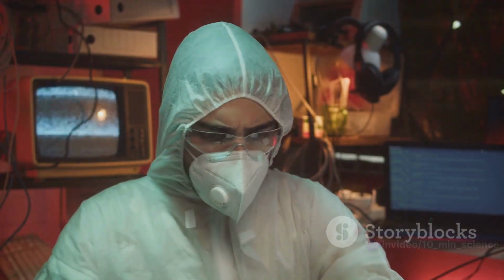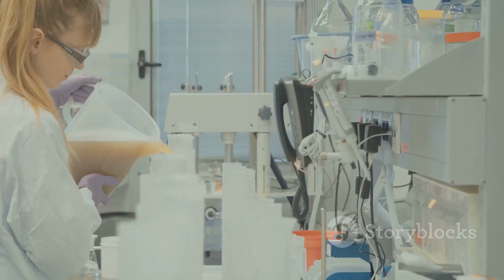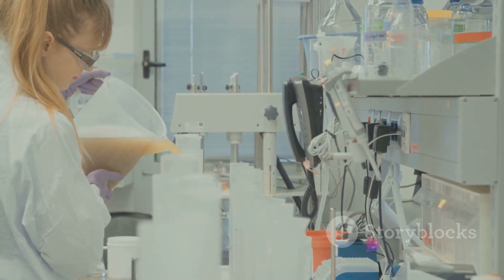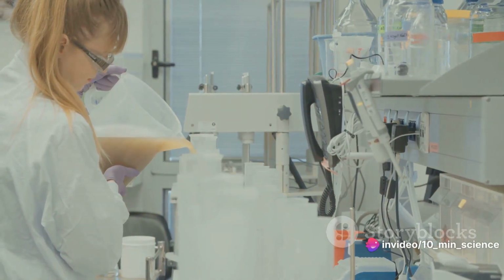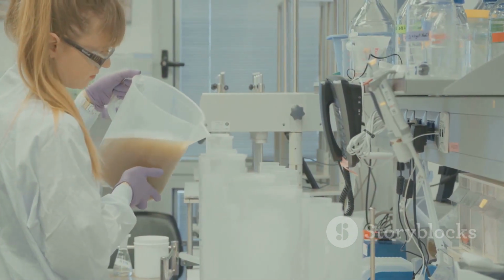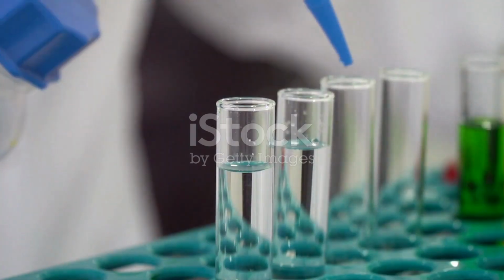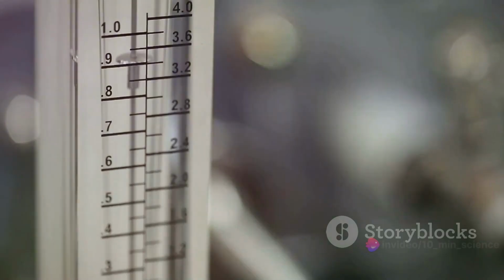High-performance liquid chromatography, or HPLC, is a technique in analytical chemistry used to separate, identify, and quantify each component in a mixture. It relies on pumps to pass a pressurized liquid solvent containing the sample mixture through a column filled with a solid adsorbent material. Each component in the sample interacts slightly differently with the adsorbent material, causing different flow rates for the different components and leading to the separation of the components as they flow out of the column.